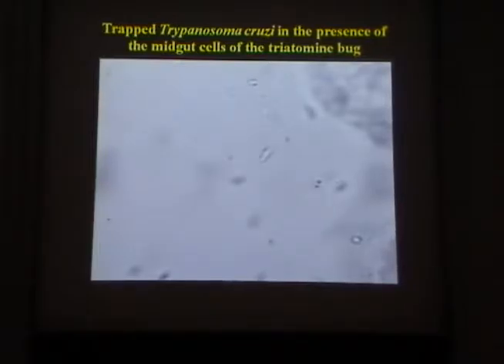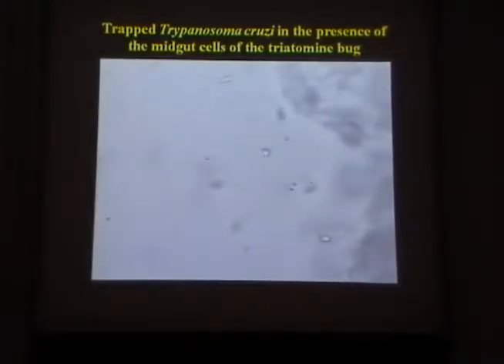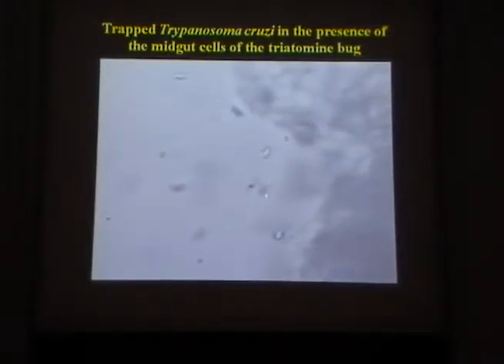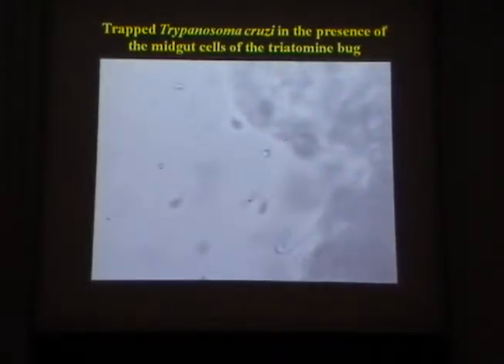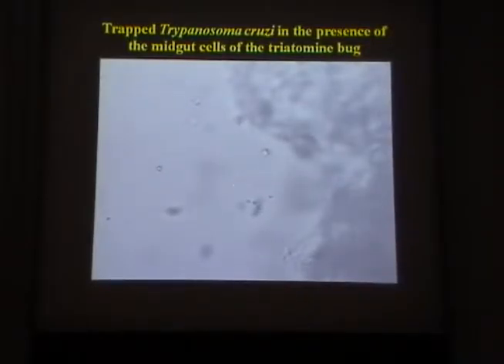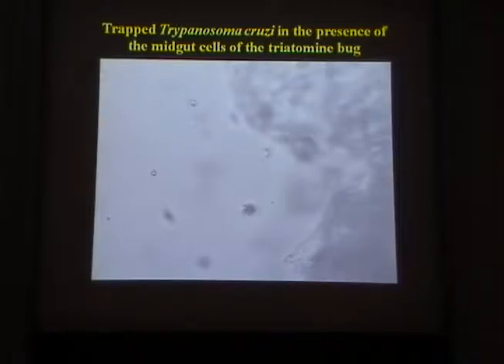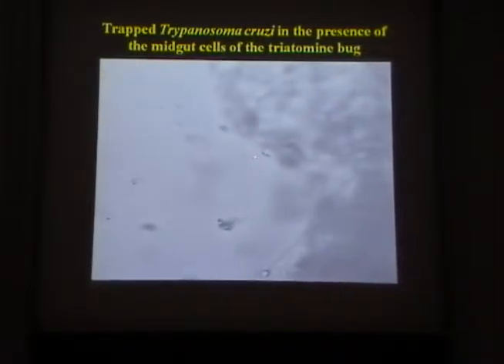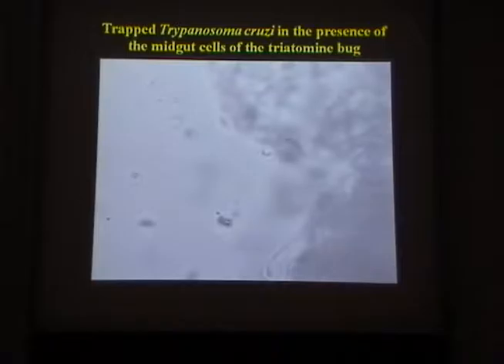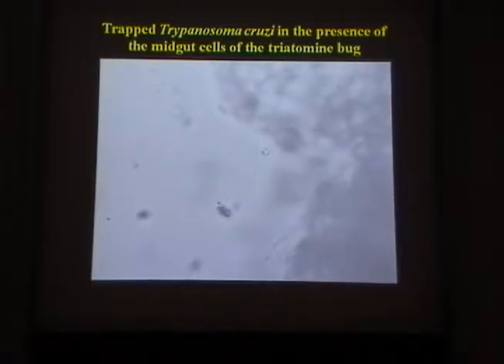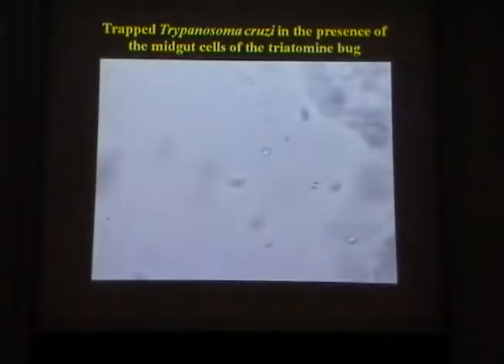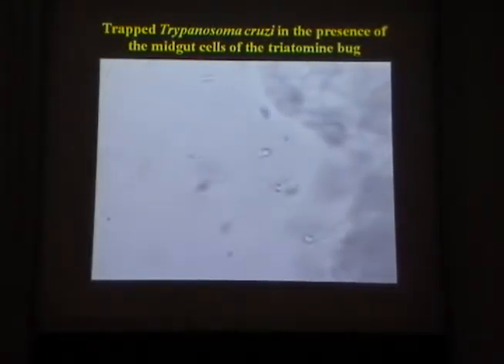Here you have the Trypanosoma cruzi. We can bring it close to the wall of the insect, and as soon as it gets close — something like 20 micrometers from the wall — it starts to show this strange behavior. You can see that it tends to attach its tail, or its flagellum, to the wall of the intestine.